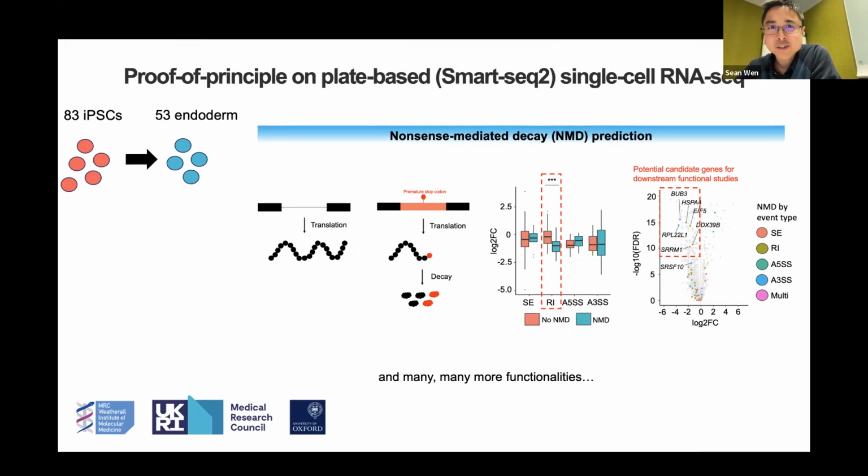And if your next question is, if the gene is expressed, but because of certain bottlenecks or amplification bias in the library preparation step, does Marvel take those biases into account? The answer is yes. I didn't present it here, but in the paper that was published, we did adjust for this kind of inherent bias that is quite frequent in single-cell RNA sequencing data sets.